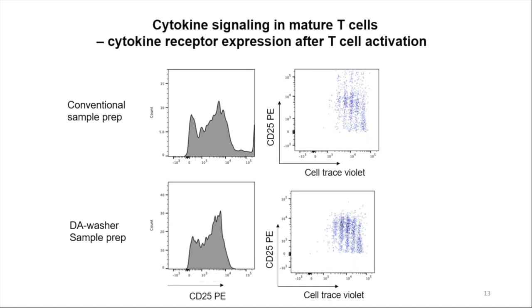Thank you. One last question I see: is there truly no mixing between the wells? I really think so, because we would have noticed that. After each wash, you can actually look at your plate, and it looks really clean. We have used some very different cell types on the same plate, and we would definitely notice if we got mixing between wells, and so far it has not happened.